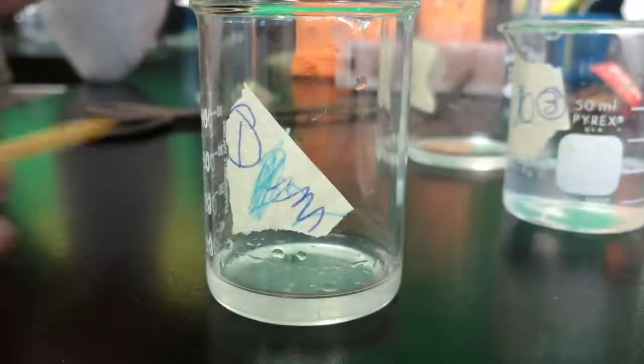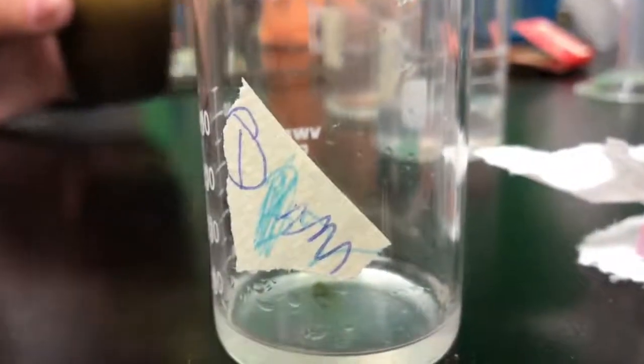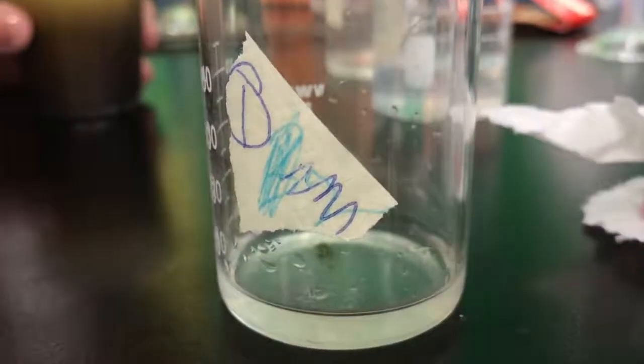To determine if the substance had the ability to dissolve iodine, we mixed iodine into the substances and saw if it dissolved. To determine the odor of each fraction, we wafted and recorded our observations.